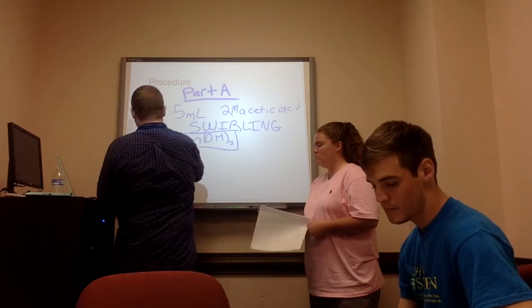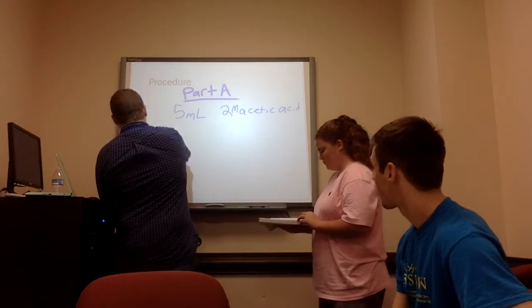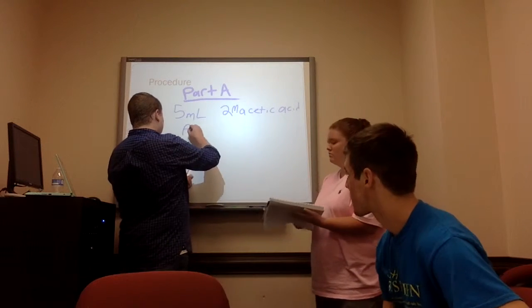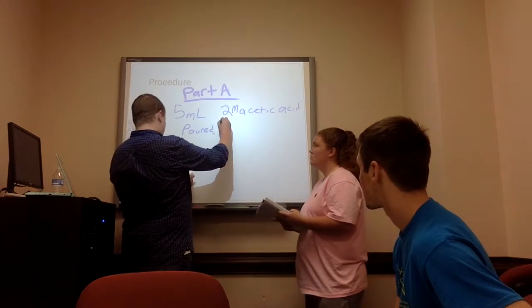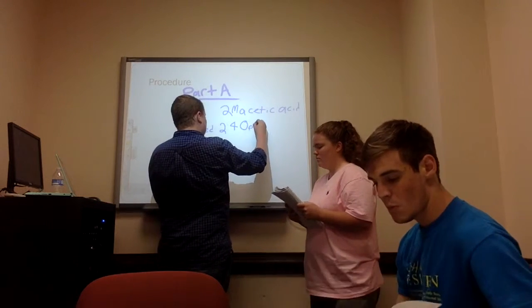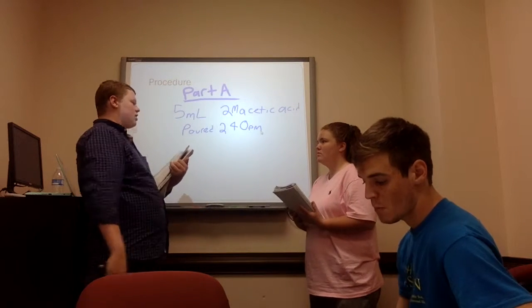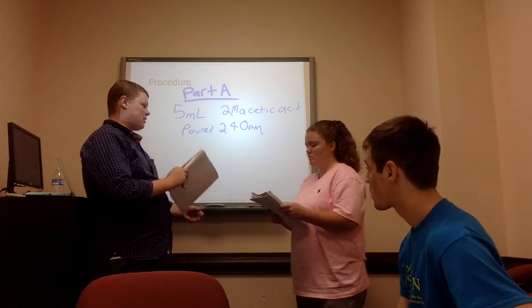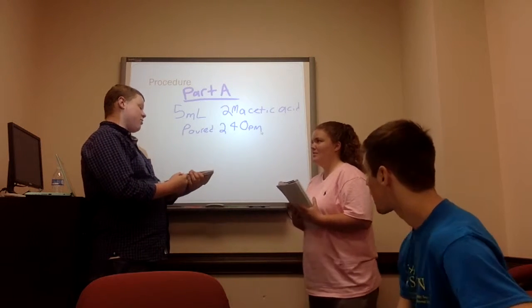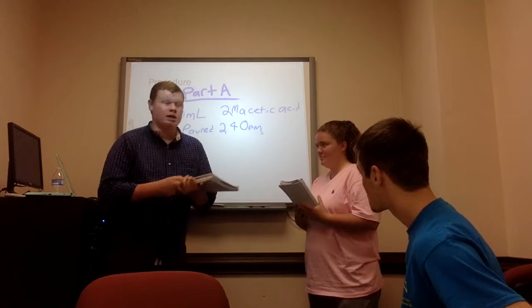Okay, so you all poured. We'll discuss this real quick. You all poured in this 5 milliliters of acetic acid at 2:40, correct? Yes. 2:40 p.m. Okay. And so, how long was this process supposed to take? It's supposed to take about 30 minutes. About 20 minutes, 20 minutes, according to your lab sheet. You may have written 30, but that would be incorrect.